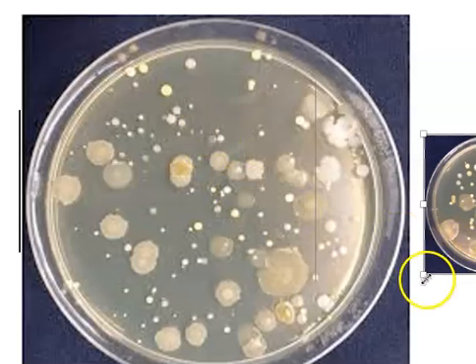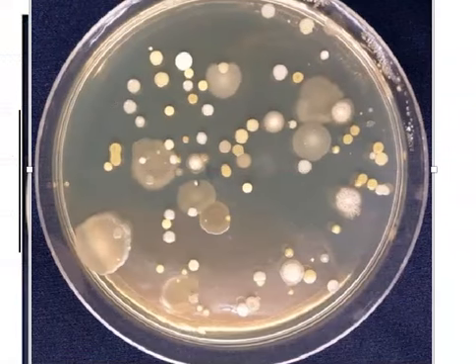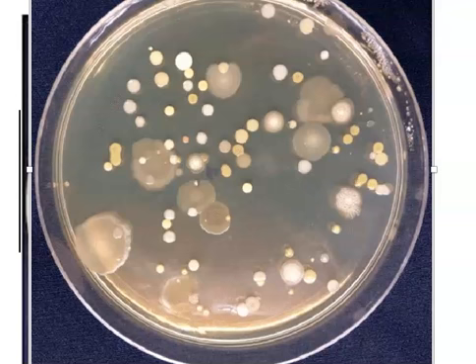Over here, I have another dish, again, an environmental sample, with different types of colonies growing. I've got two colonies right here that have grown into each other. That's not unusual. Cells just landed here very close together. So as these two colonies formed, as the parent cells were dividing and dividing and dividing, they just sort of merged together. Sometimes you'll get one colony growing on top of another colony or sort of overlapping another colony. That happens as well.